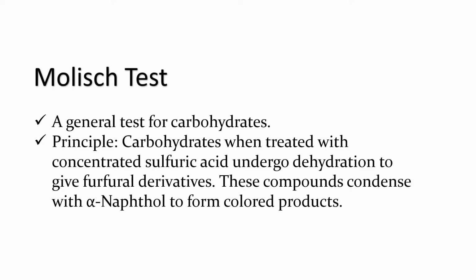Okay, so now let us discuss in detail the specific qualitative tests for carbohydrates. Let us first discuss the Molisch test. So the Molisch test, as I have said a while ago, is a general test for carbohydrates. So for example, if you want to figure out your unknown solution and you have an idea that it might be a carbohydrate, to confirm that, then what you should be doing is a Molisch test.